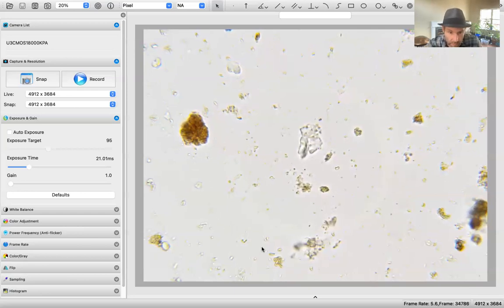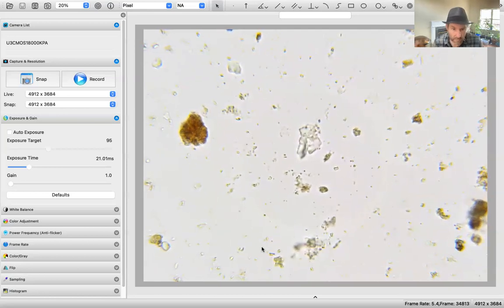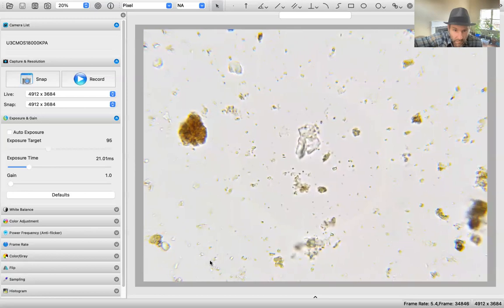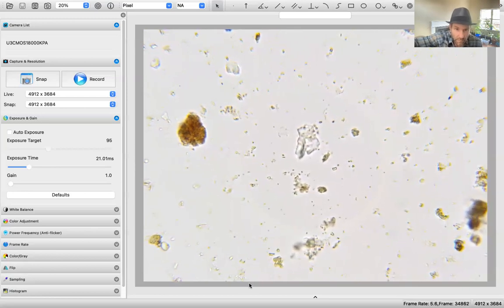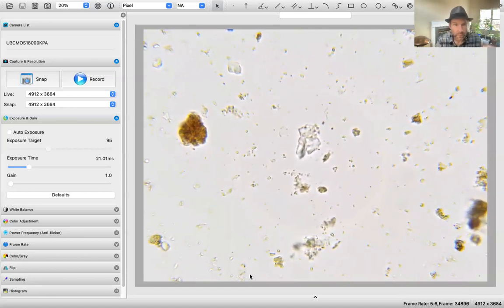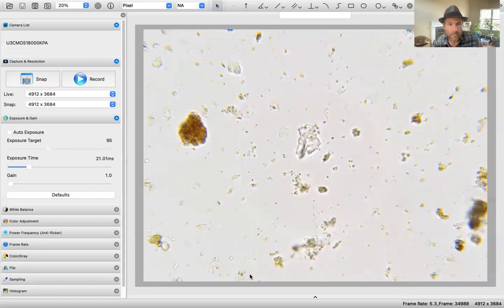Oh, actino again. I knew I'd start seeing actino because all the other organisms are gone. All right, it's in the bottom left. It's going to be a hard one for you guys to see, I think, but it's right here. It goes all the way up right there, comes down. And I'm going to call that a 2.2. Okay, moving forward.